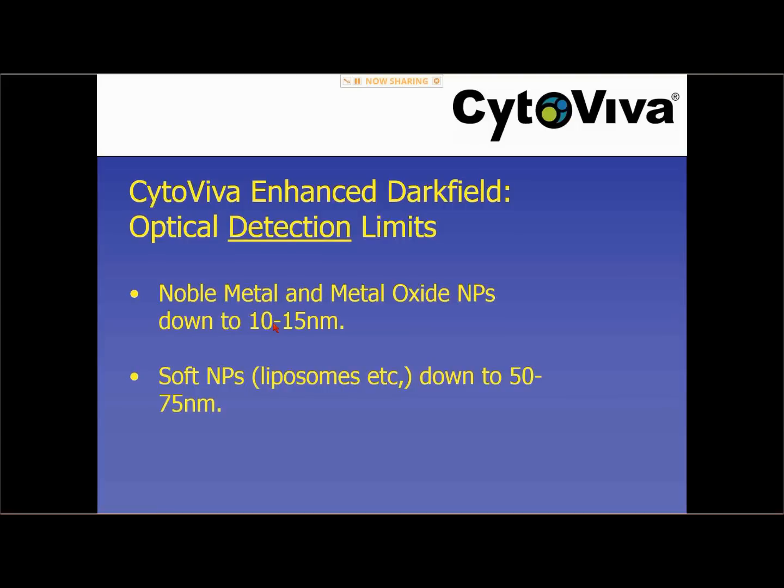When we look at soft nanomaterials such as liposomes, etc., typically we're able to see a scatter detection of those materials down to about 50 to 75 nanometers.